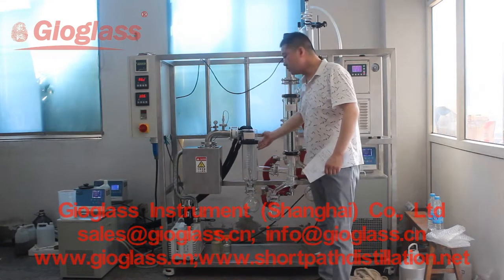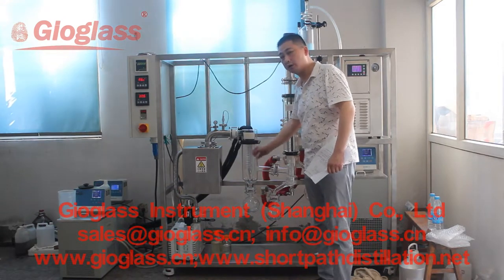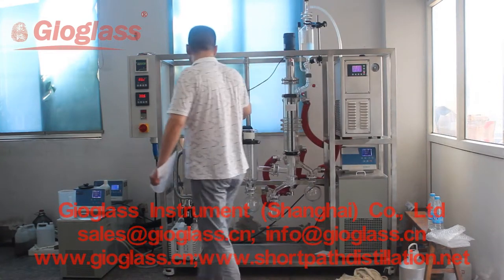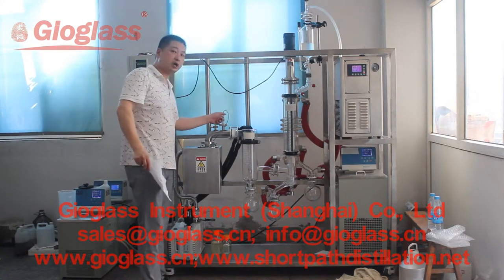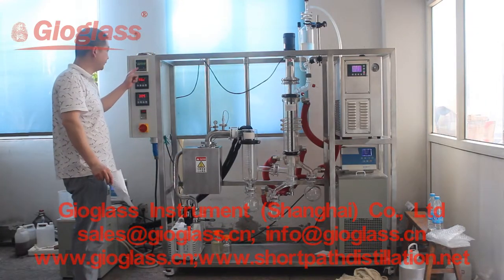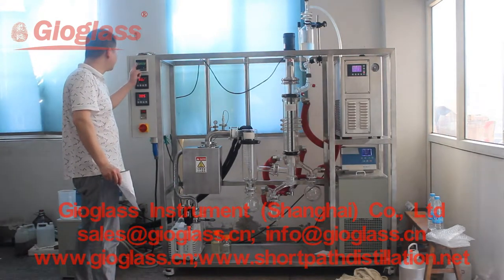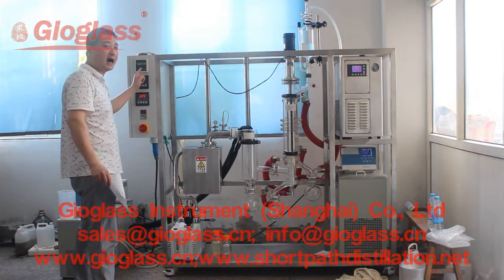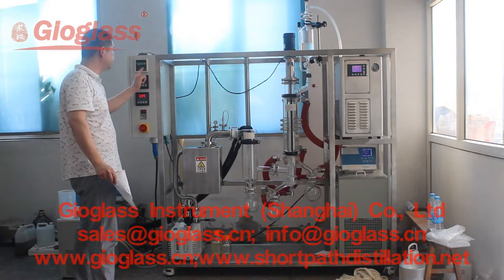Here is the cold trap to catch the gas and water in the feeding material. Here is the sensor to measure the vacuum degree, and the display here. You can see the vacuum degree is 0.0008 mbar, which means it is 0.08 Pa.